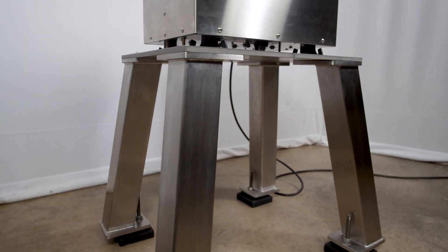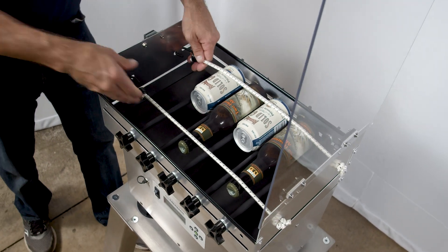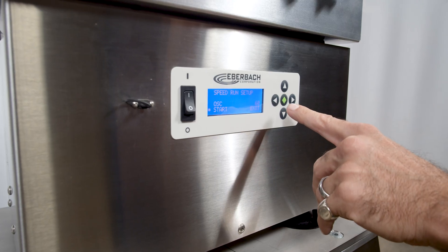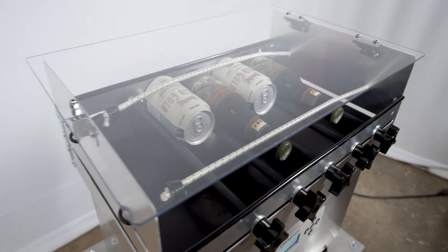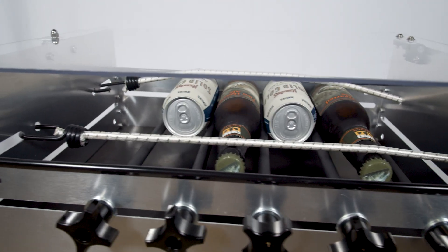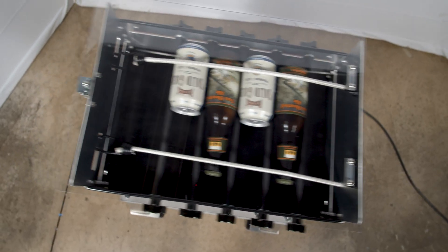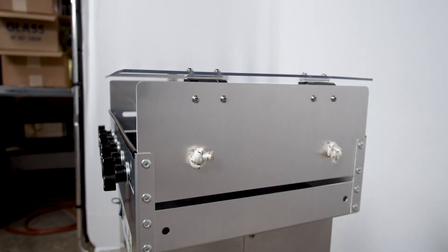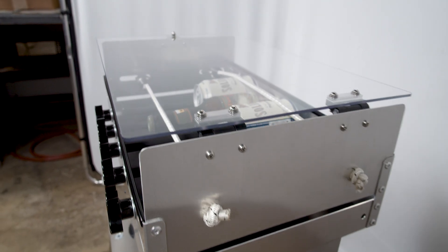They can be powder coated steel or stainless, as shown here.